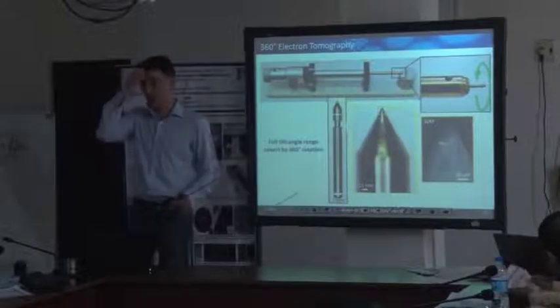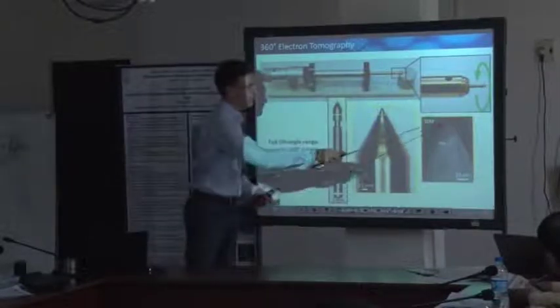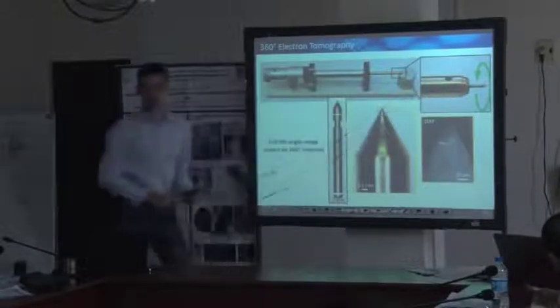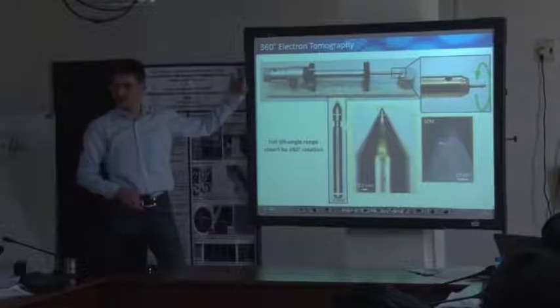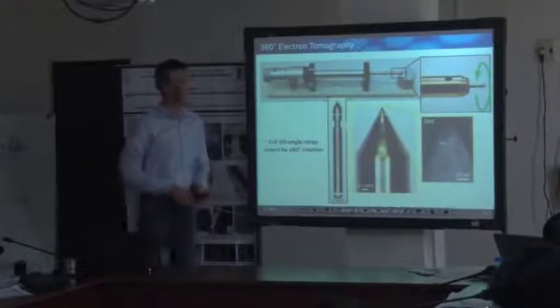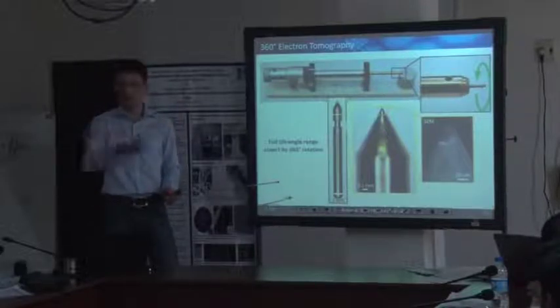So you position any structure on top, and you might want to shape that using the focused ion beam by removing some of the material. But in principle, this is what is mounted with this tomography holder. And it's not that the tomography holder rotates by 360 degrees to record all those projections. It's more that you can use the stage of your microscope to cover a tilt angle range, let's say of plus minus 70 degrees or 60 or 50 degrees.